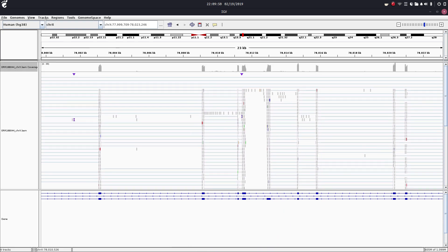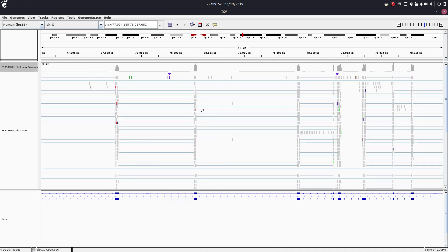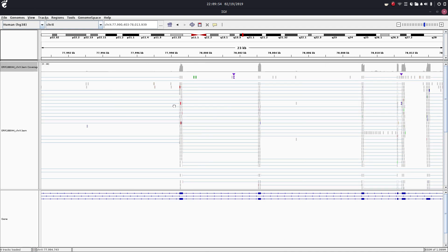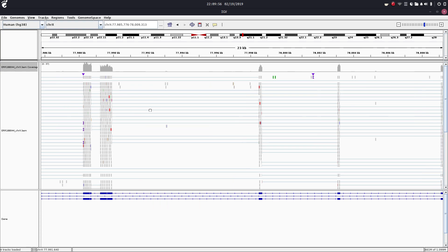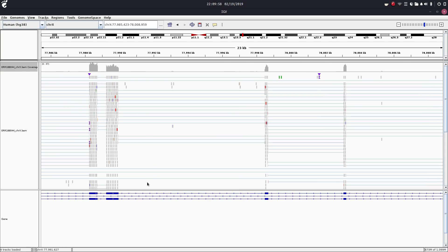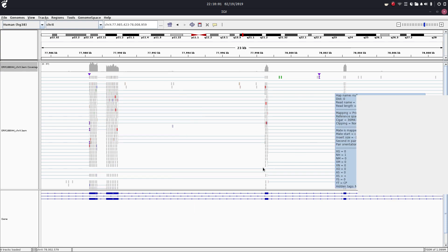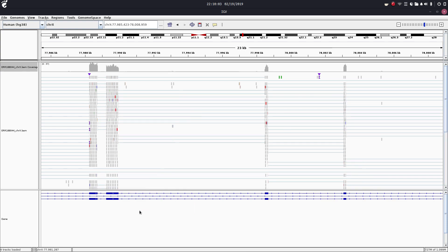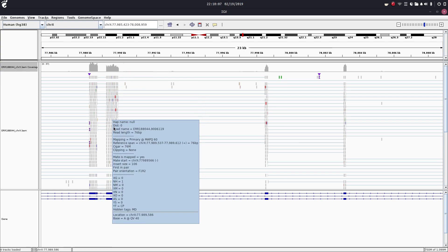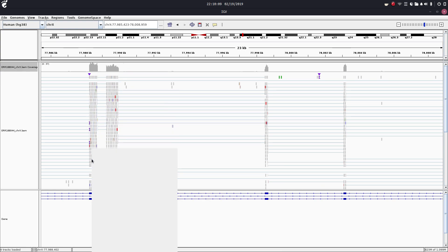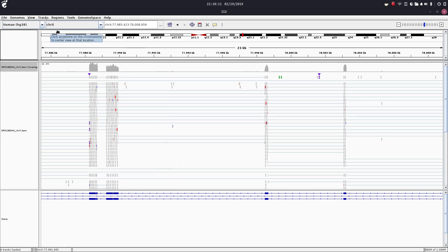That's how you view your BAM files in IGV. I thought I'd give you guys a sneak peek of what that looks like. If you're going to be using large RNA-Seq datasets, this is an extremely good way to visualize introns and exons and how well your reads mapped to our reference genome.